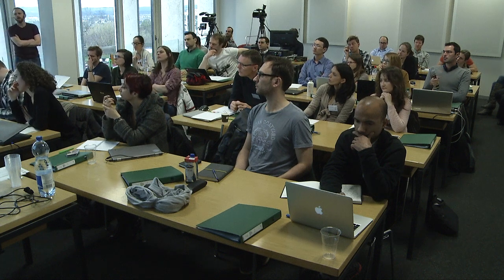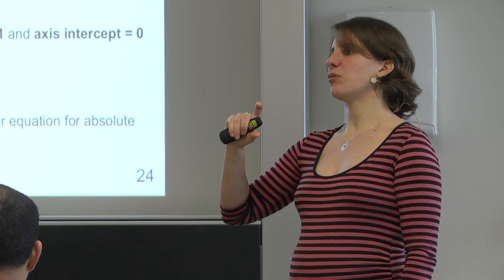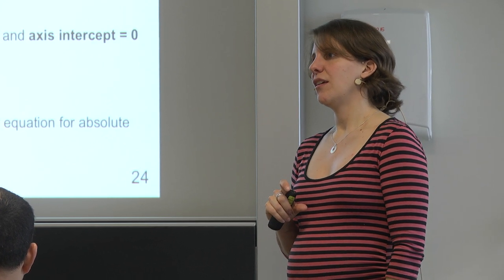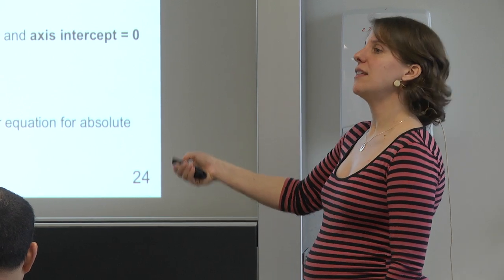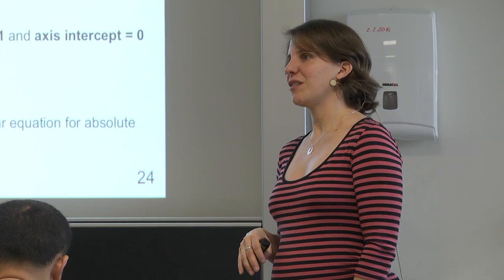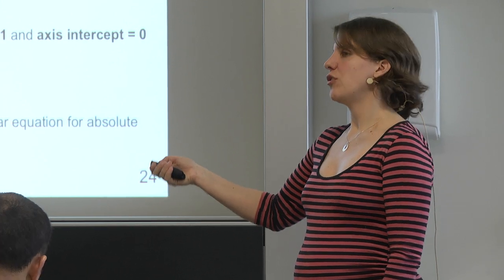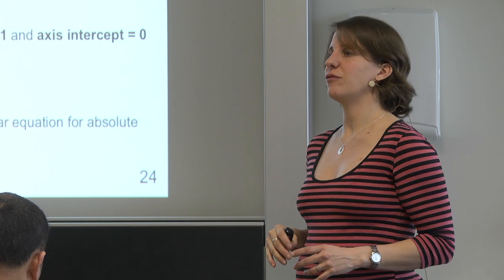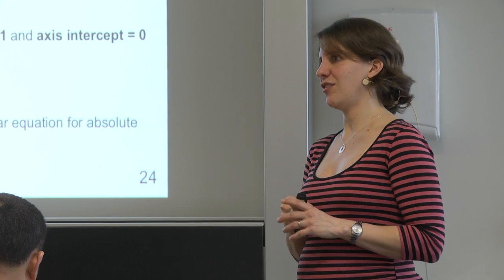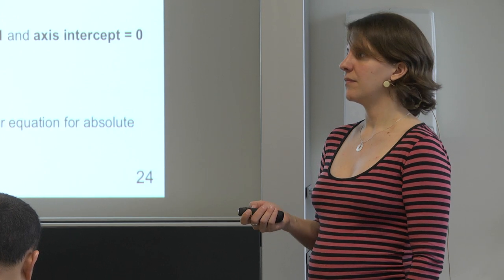Can you use the same calibration curve for several days? When you make this external calibration curve, you usually try to make it relative to a ratio. So you don't use the absolute intensity on this axis, which of course can change depending on what shape your mass spectrometer is in on a certain day. So usually you try to make it relative to something. You plot ratios between a heavy and light version, so that you are not prone to this day-to-day variability of mass spectrometers.